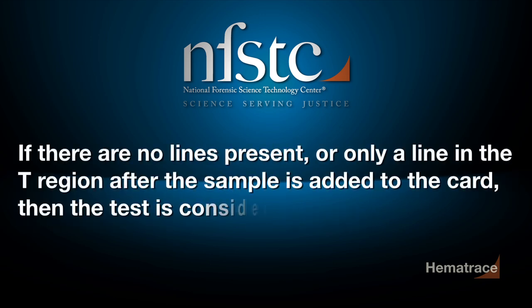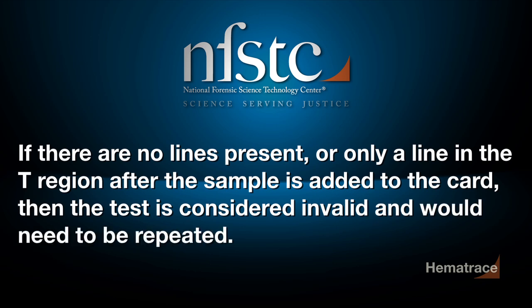If there are no lines present, or only a line in the T region after the sample is added to the card, then the test is considered invalid and would need to be repeated.